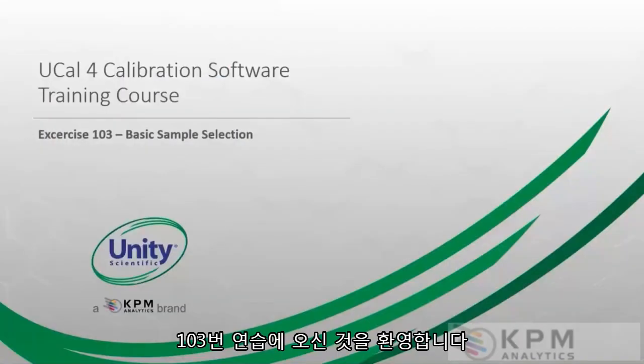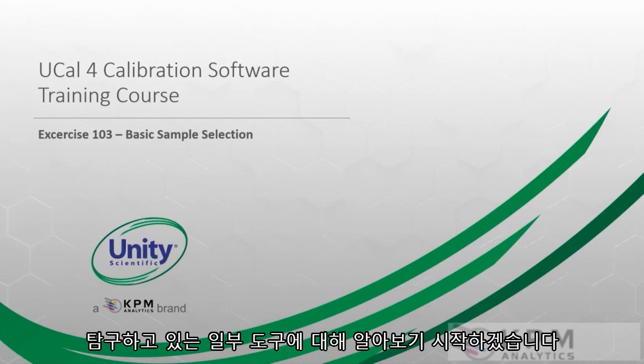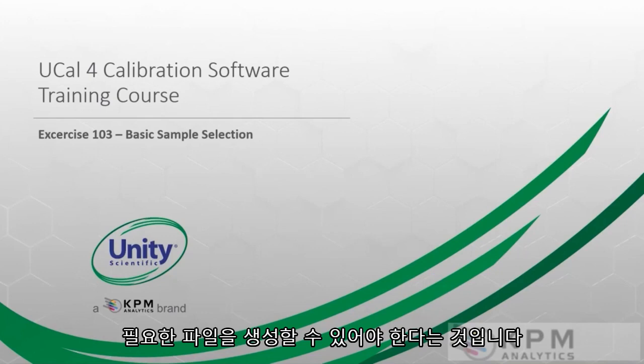Hello and welcome to exercise 103, basic sample selection. This is going to be a pretty quick lesson, a pretty quick exercise. We're starting to get into some of the tools. We're exploring the tools, and the idea is that you need to be really fluent and be able to easily move around your samples and create the files that you need.